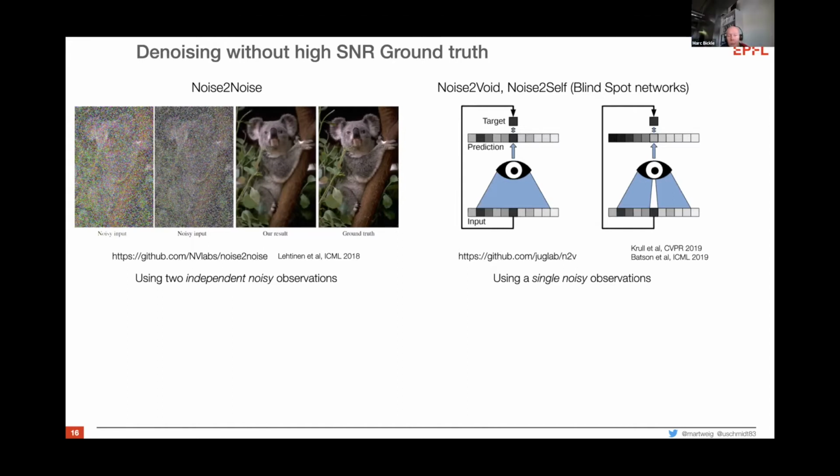And of course, I will speak about the validation aspect. You always have to make sure that whenever you train your network, the data is similar to the data you then apply it on, right? Because that is the core assumption for almost everything in machine learning, and particularly in image restoration. If you don't do that, weird things will happen, and you try to avoid that. But I will speak about that later.